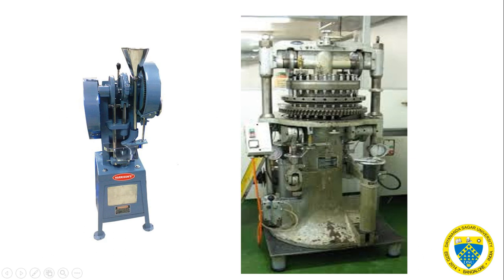The one over here is the single punch instrument. We can see there is a hopper in which the granules are stored, and then we have an upper punch, a lower punch, and in between there is a die cavity, into which the granules from the hopper are carried through the feed frame and fall. Once they fall into the die cavity, the upper punch and lower punch come together with a compression force and compress the tablet. Here it has only one upper punch, lower punch and die cavity, so at one compression, only one tablet is prepared.